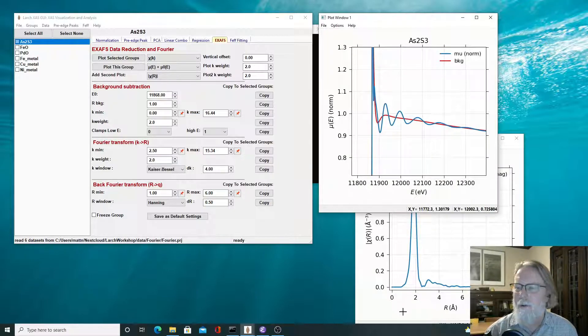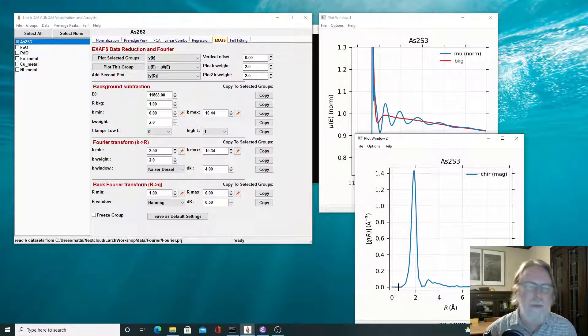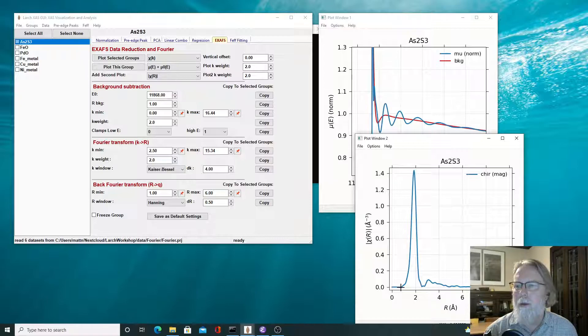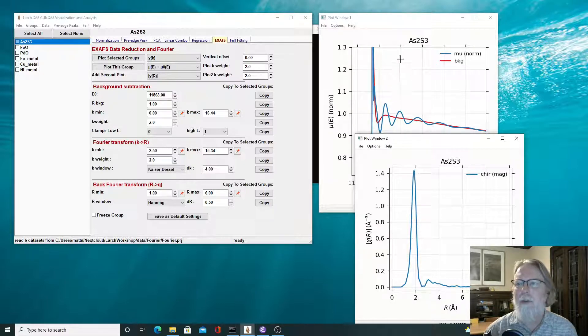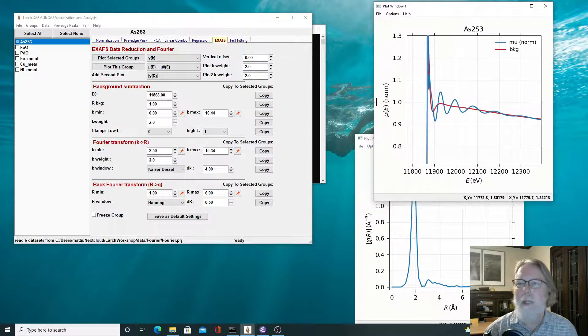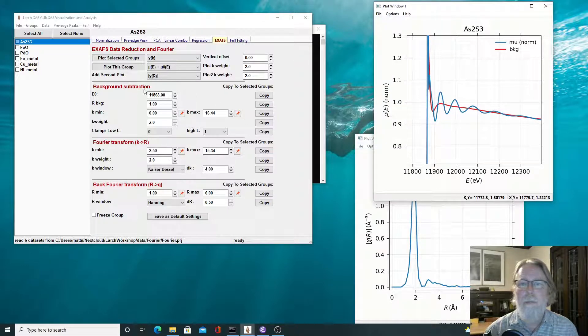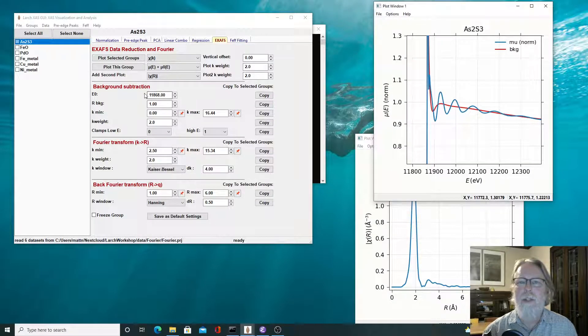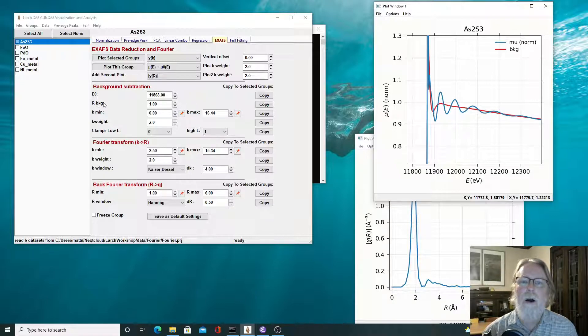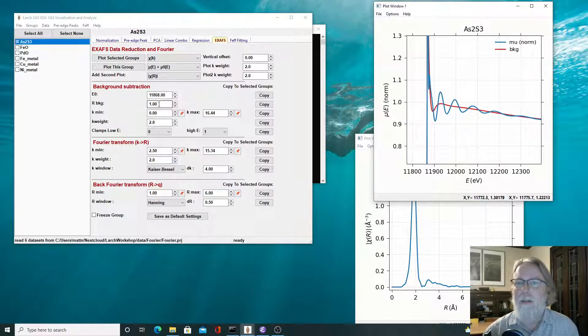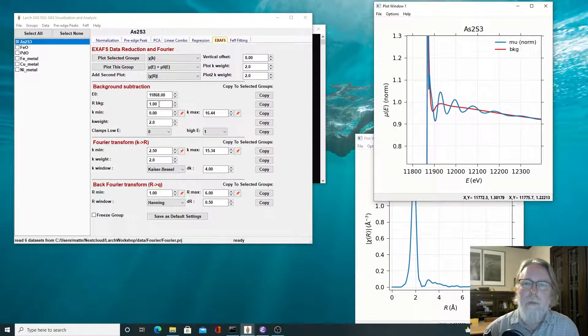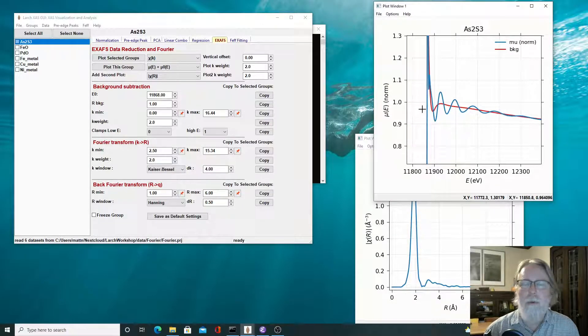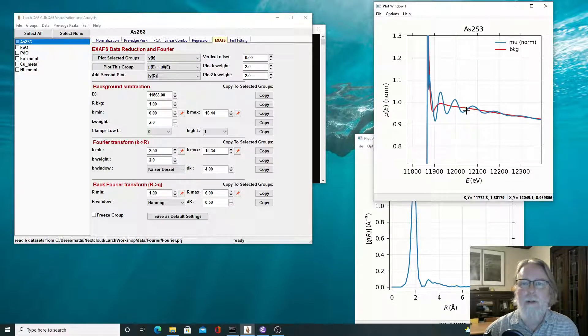Those have a lot of variability built into them. So you can make them follow any curve you want. So we want to make sure that we limit the curve so that it subtracts the smoothly varying part, the low frequency component, but not the XAFS oscillations themselves. So a value of about one angstrom is a good starting value to think about for selecting the background function. So in this paragraph of this page, there's the energy threshold E zero, and then there's this parameter RBKG, which is set to one that's in angstroms.